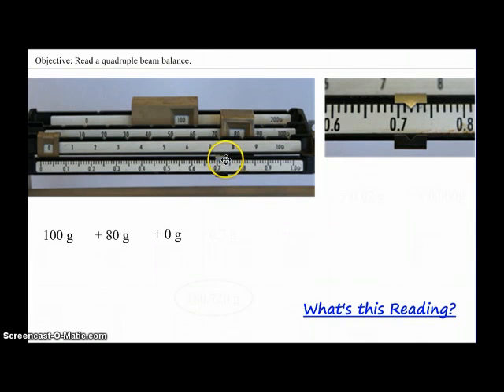Remember, we're going to take a look at where the rider is and we're going to go to the number previous right in front of it and we're going to see that it's 0.7 grams. Taking a look closer up on the upper right-hand side here, we can see that the pointer is right on that second line, so our next reading is going to be 0.02 grams. Now, because there's no point in the spacing, our final number is going to be 0.000 grams. When we put these all together, we're going to get a final reading of 180.720 grams.